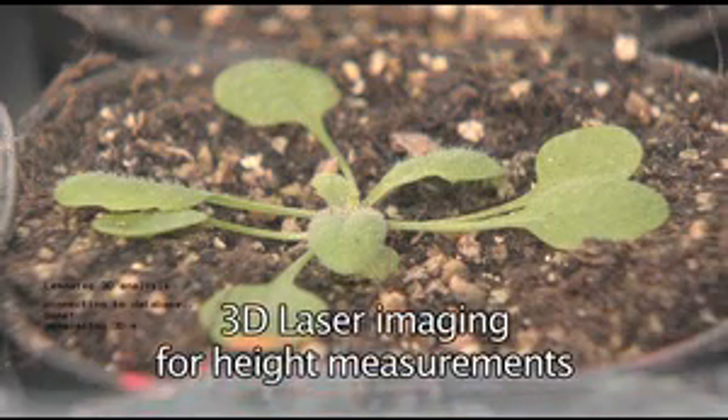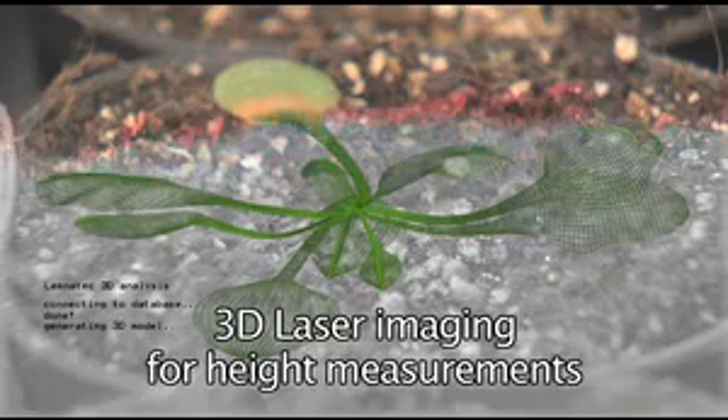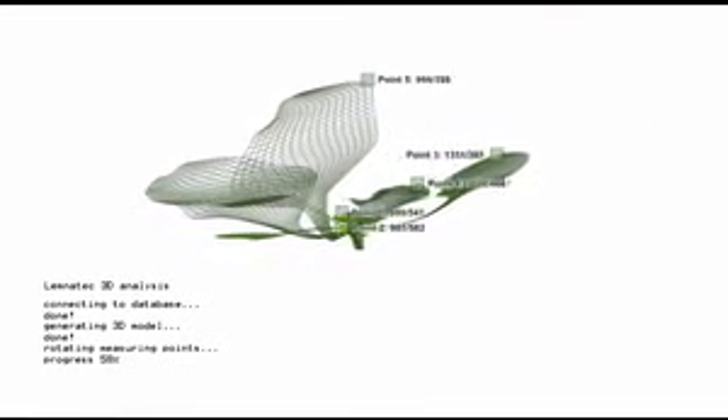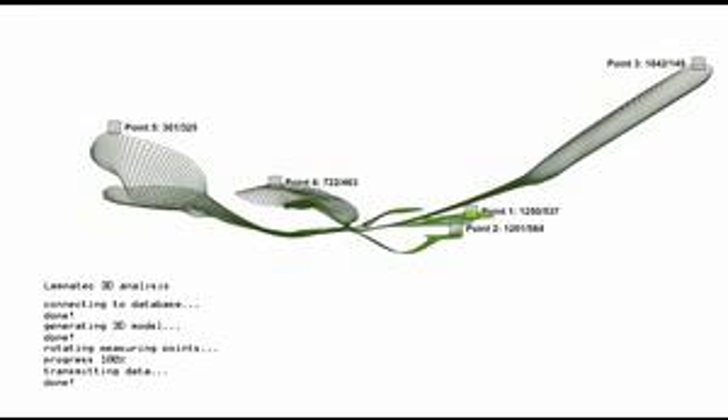The application of laser triangulation for height scanning closes the gap between two-dimensional imaging from the top and three-dimensional imaging from the side, which would not be possible in trays. Height differences of up to 200 microns due to growth or, for example, leaf movement can easily be quantified by this method.